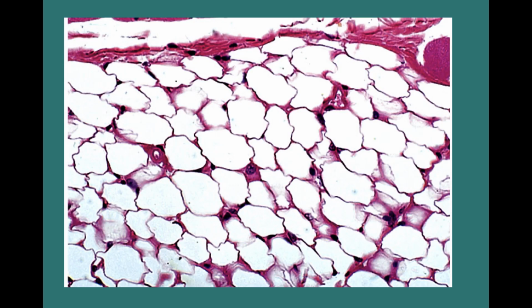All right, and then when we look at our last slide here, you might be looking at this and saying, okay, well, I see some plasma membranes. This is very thin, and don't let it fool you into thinking that this is like a simple squamous, but we have these really big empty spaces here. You can think of these as inflated balloons.